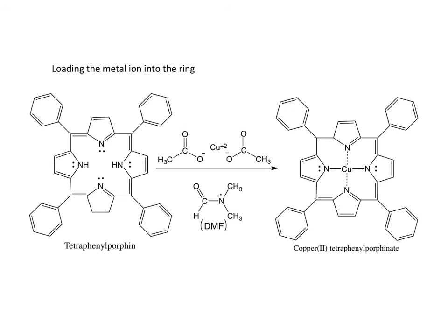Okay, so to put our copper in the center, we are going to do one of our favorite things, which is to reflux in order to heat this without losing material. And we use copper, right? Here's our copper 2. And we're going to use copper 2 acetate.